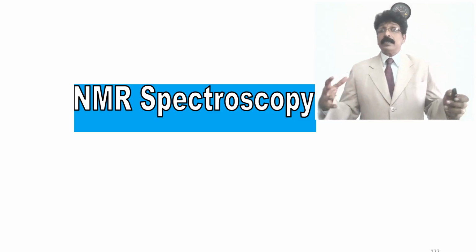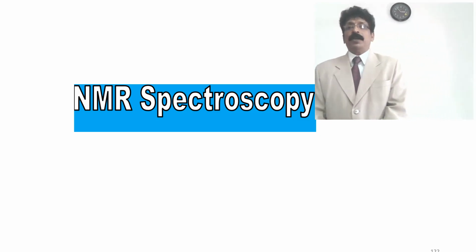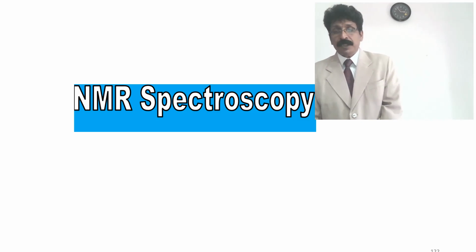I cannot discuss the complete details as in analytical chemistry or instrumental analysis, but it is still needed for you to write about what NMR spectroscopy is, how it works, what spectrum is available, and how it is applicable to herbal formulations or herbs, and to the characterization of isolated natural compounds.